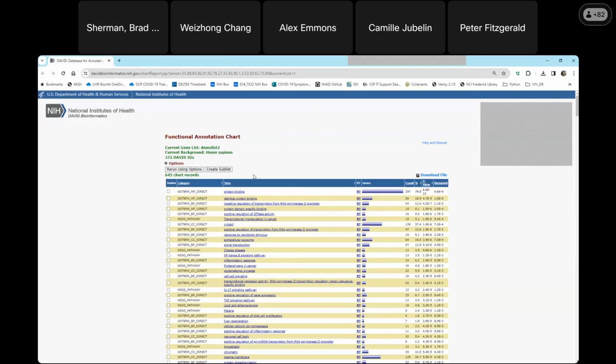More specifically, it should be U95A microarray, because what you want your background to be is all of the genes that you had some kind of chance of selecting in your experiment. So in the case of some of these human genes, maybe they weren't on the array. So ideally, I would want to use the array as the background. But we find that most experiments use almost genome-wide sets of genes, so it's not that big of an issue to use it here.